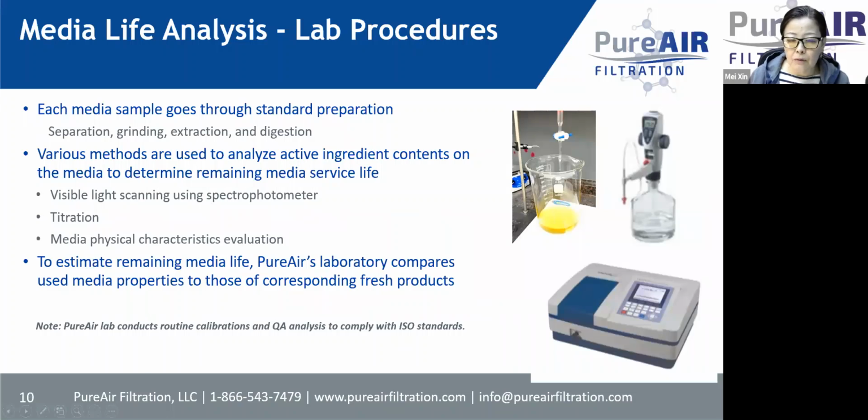So we talked about how we pack the sample, how we label the sample, where to collect the sample. Next, I will give you a very high level introduction on the lab procedures we use to do media life analysis. Sometimes a customer has a question about why the data doesn't look good to me, I have an expectation, so I will go over some of the details. Maybe it helps you to understand our procedure, and also helps you have a better practice to collect the sample for us.